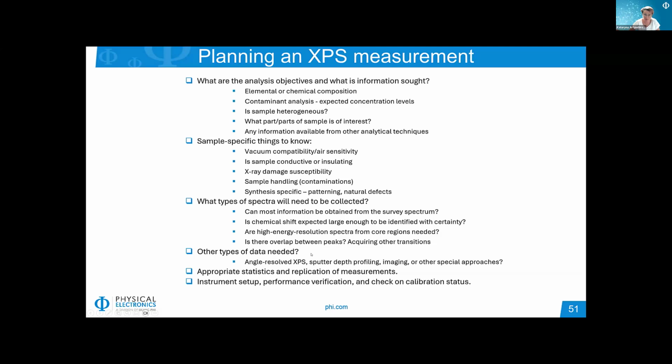Without that, nothing else matters. And references, if you have references, they always help. It's better to invest time in running references and analyzing your actual samples than to realize later that without references, you're not able to answer the question.